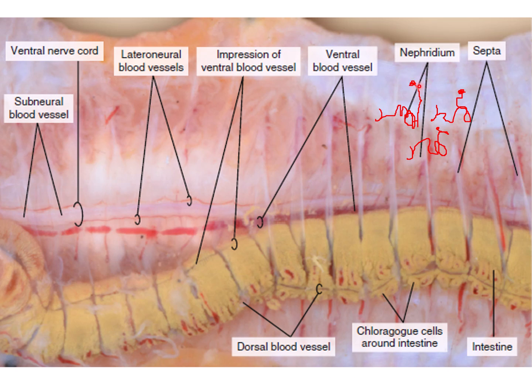And here near the nephridiopore the tubes are bulged and make a collection bladder, and then it opens to the nephridiopore. These nephridia may appear as yellowish tubes, and they are very tiny, so they are not clearly visible. We have to see them carefully.